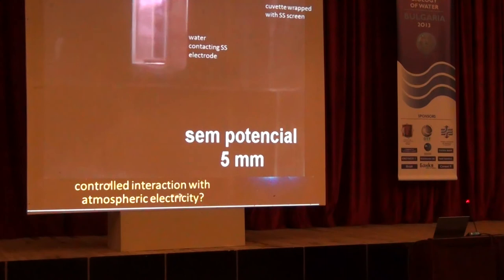So in many cases, we can see a pixel with a very positive potential. It decreases, it is surrounded by others with negative potential, and we don't see the corresponding change in the neighbors. So, not that I dare to challenge Schrödinger, but I think that the big effect of humidity that you mentioned, which is absolutely correct, is not surface diffusion. I think it is largely exchange to the atmosphere, following the same mechanism.